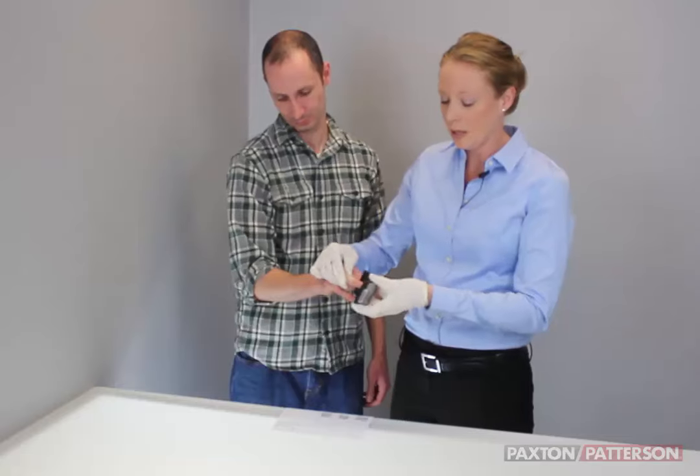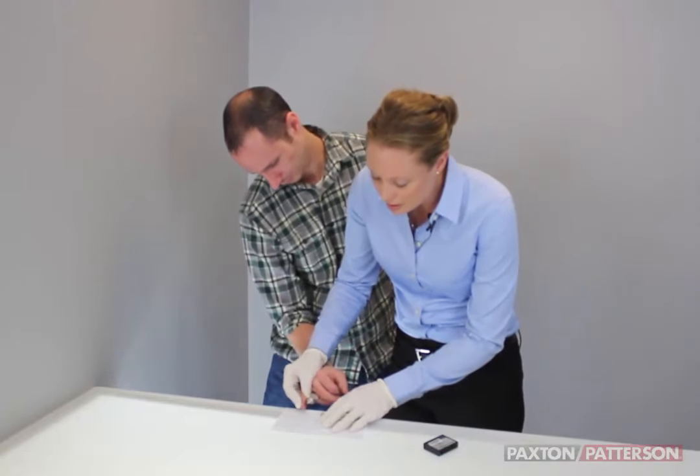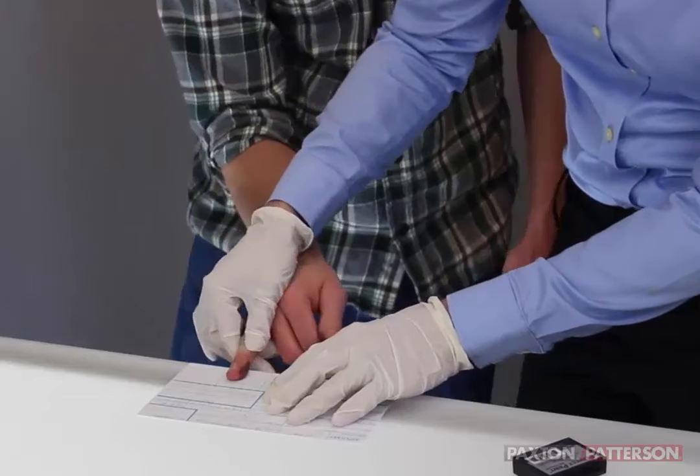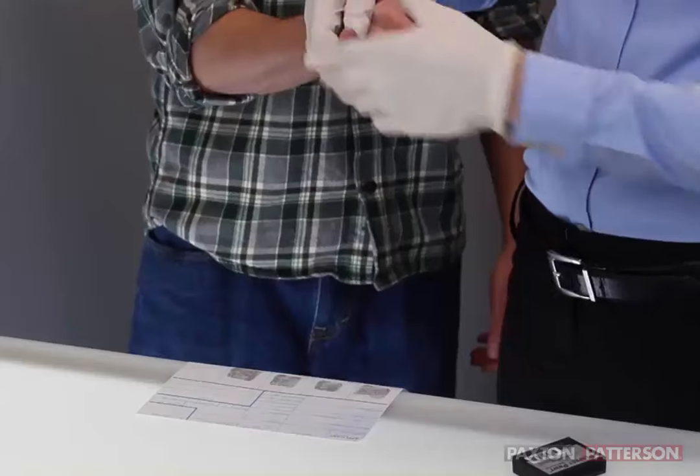Remember, when we're looking at fingerprints — and we'll be looking at those at a different time — we're looking at very small details in the print. So we want just the right amount of pressure so we can see those details clearly.